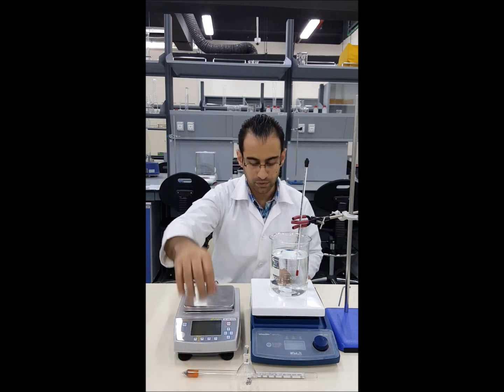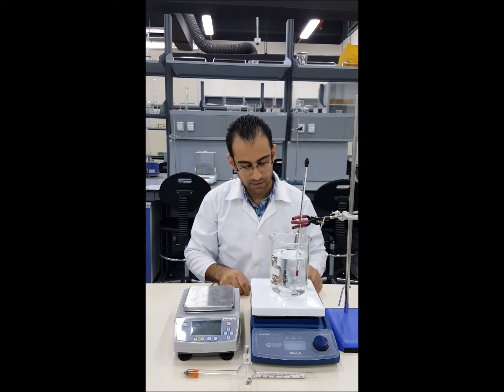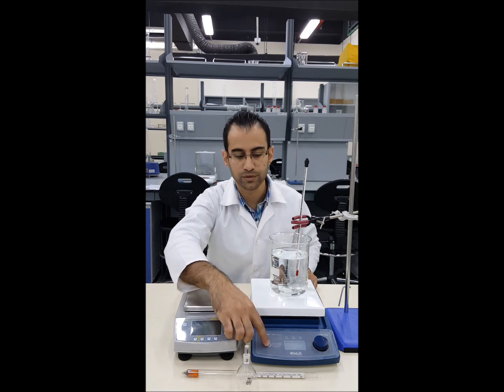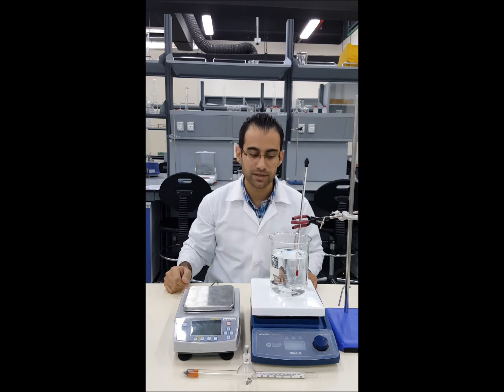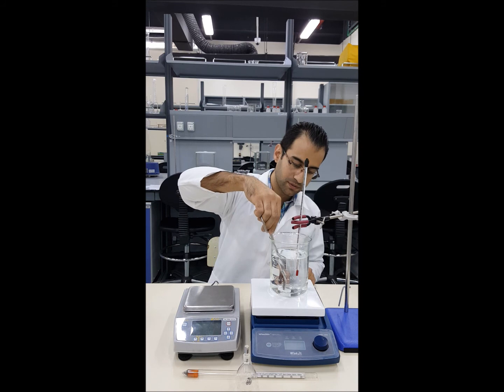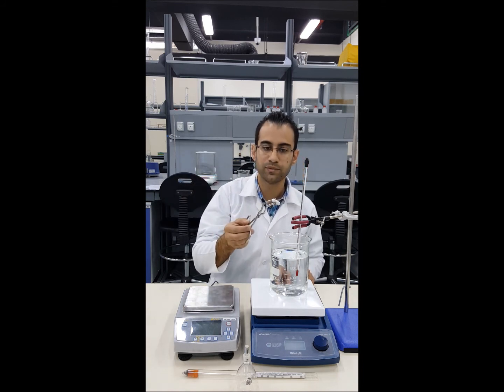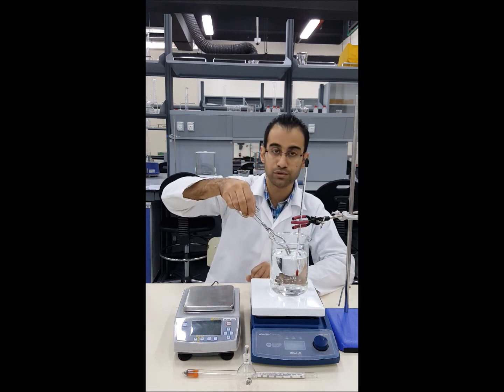To heat the water we are using this ceramic hot plate. We switch it on and between the modes you can change between three different settings. The first is the stirring function, which uses a magnetic stirrer — there is a small magnet inside which turns based on the RPM we set.